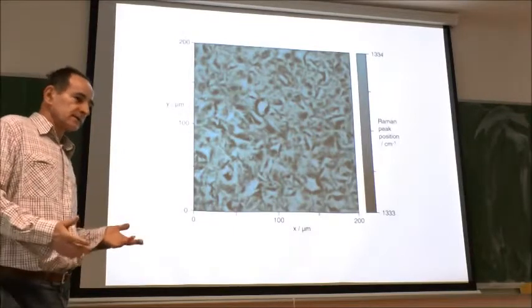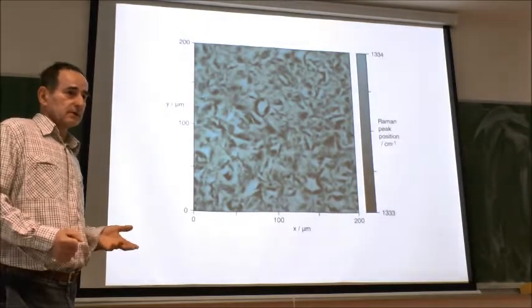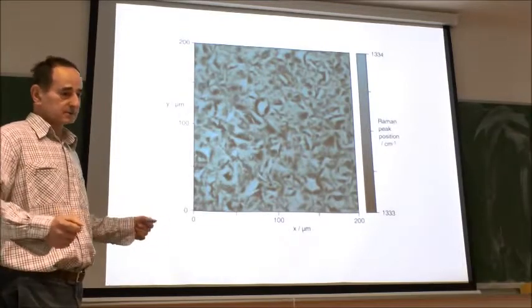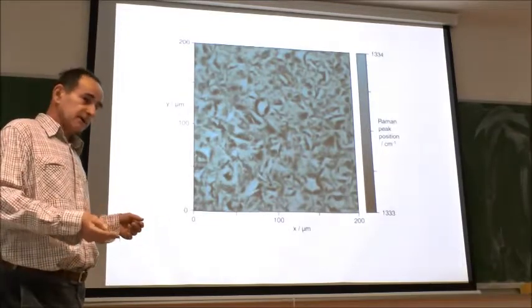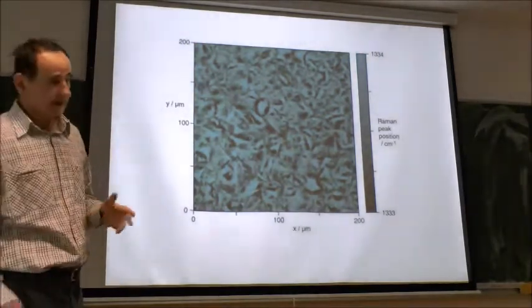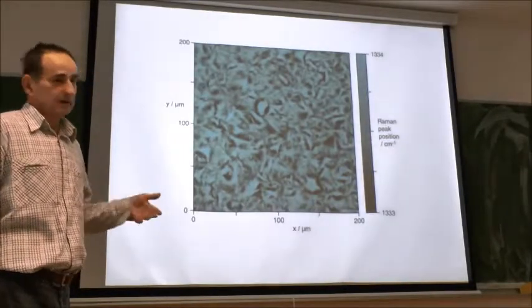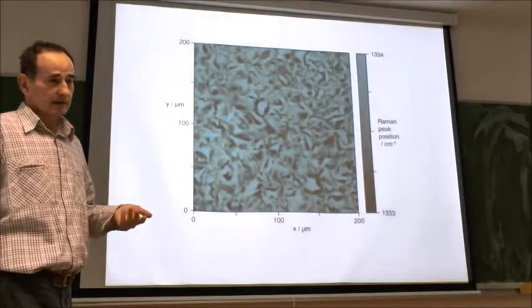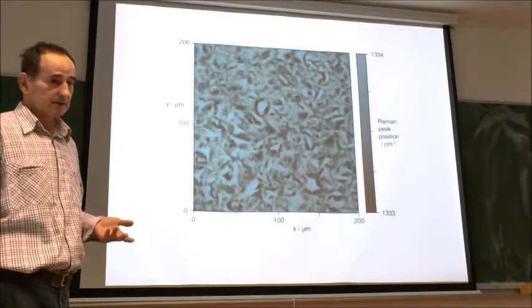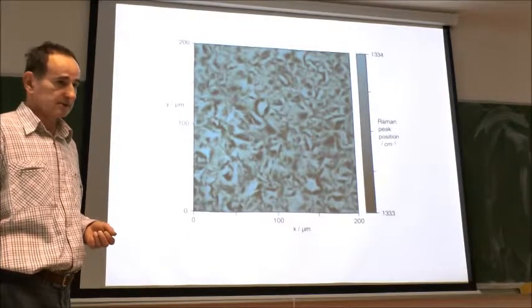But on the other hand, I didn't mention that there is an option on the microscope where you can bring really big objects. So you can measure Raman from the side. There is a connection which would reflect laser light to the horizontal position. But of course, you cannot scan on the notebook. It's just a bulk measurement.